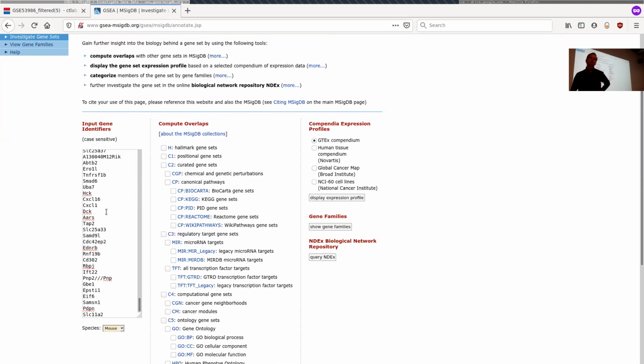And actually, one useful thing to understand about gene symbols is that mouse gene symbols start with one uppercase letter followed by lowercase letters, and human gene symbols are all uppercase. Usually it doesn't matter much, but sometimes it's useful to understand which genes are which.